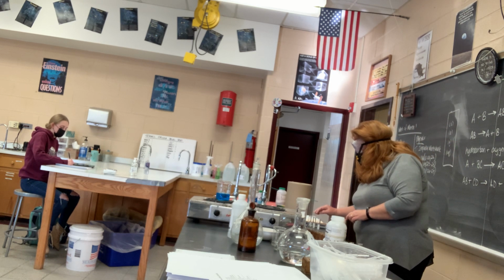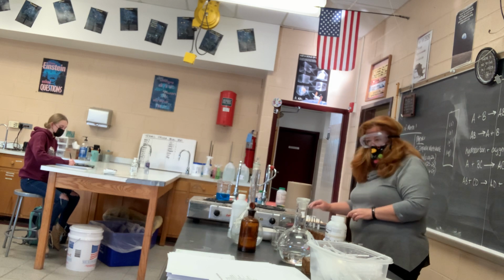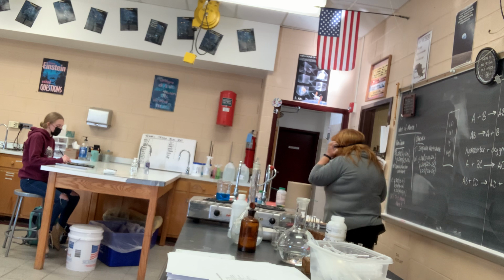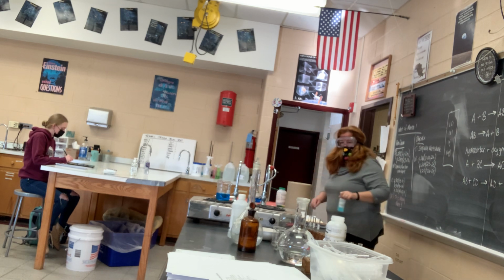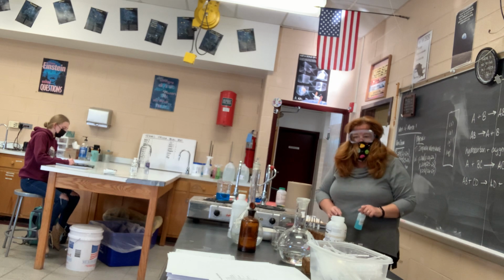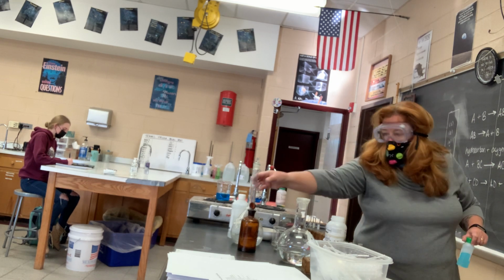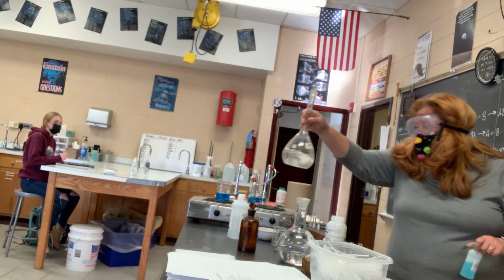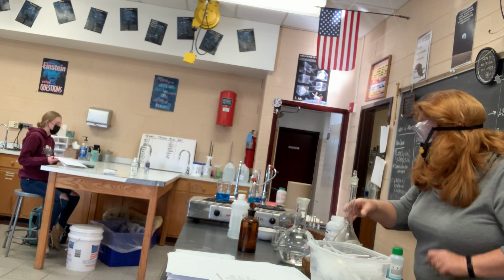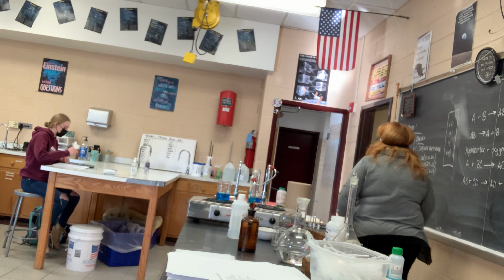Okay, and the last one, copper sulfate and hydroxide, and that's why. Yeah, this is sodium hydroxide. That looks gross. Well, it'll be what it'll be. I'll make that.